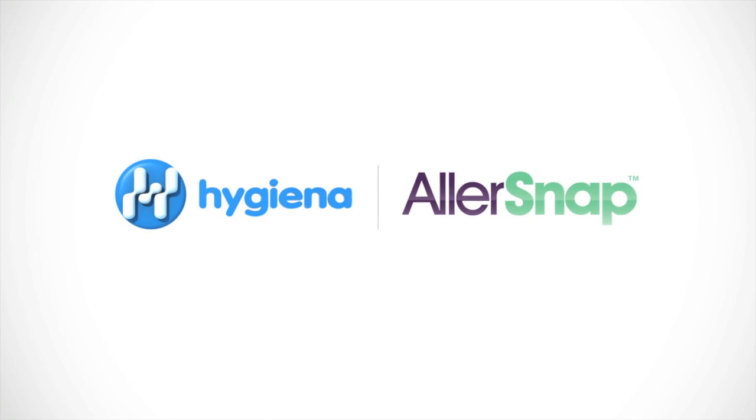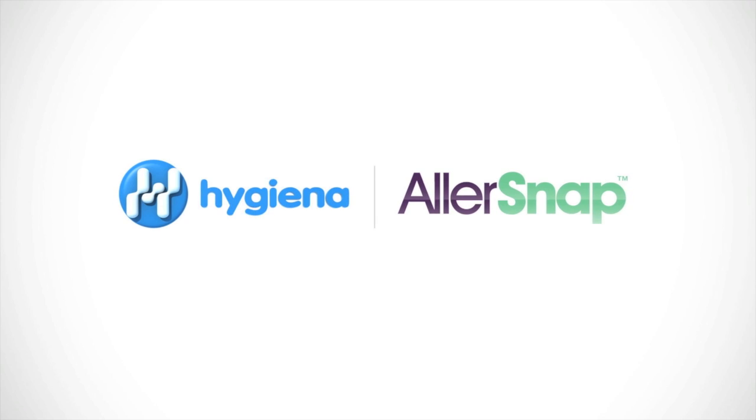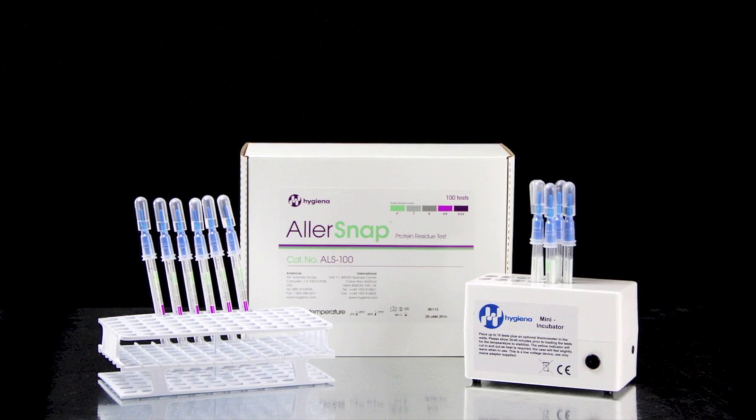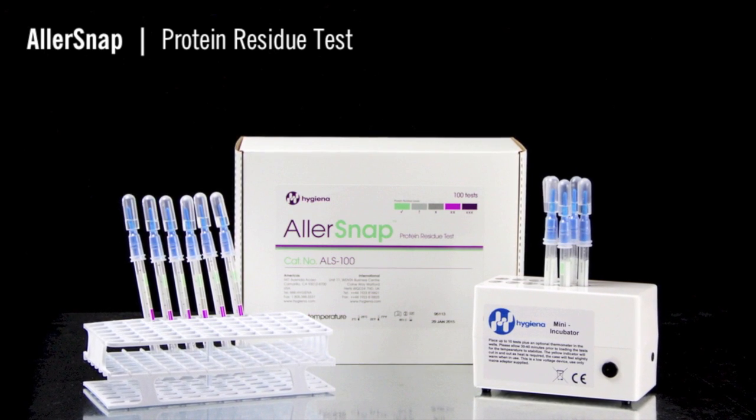This instructional video will demonstrate the proper use of Allersnap, Hygiena's allergen prevention test. Allersnap detects a broad range of proteins in one device to verify allergen removal from surfaces.